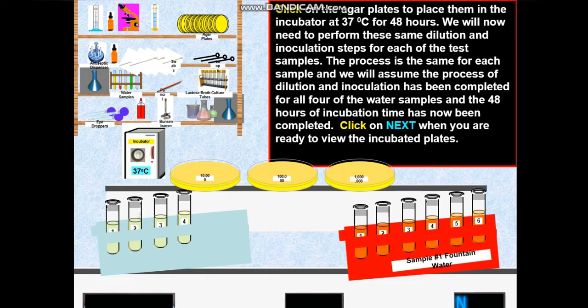Click on the agar plates to place them in the incubator at 37 degrees Celsius for 48 hours.